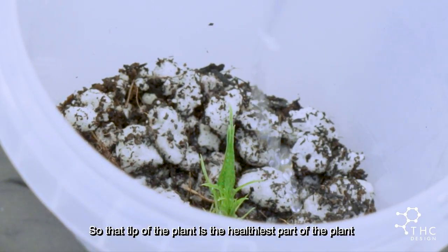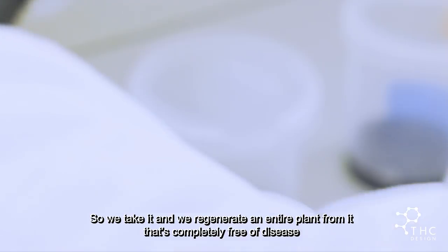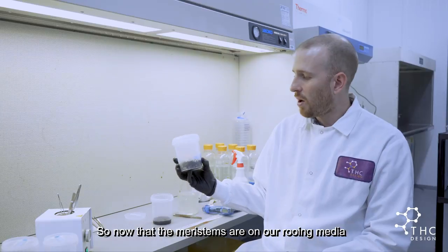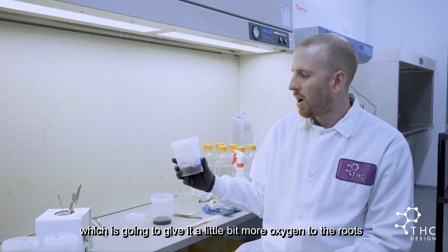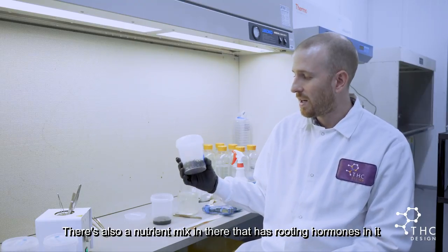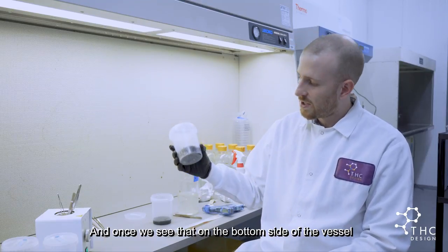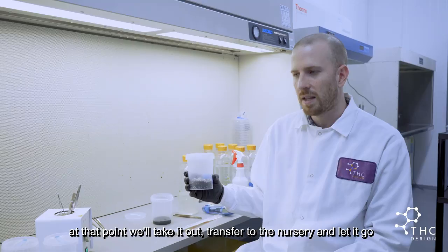The tip of the plant is the healthiest part, so we take it and regenerate an entire plant from it that's completely free of disease. Now that the meristems are on our rooting media — which provides a bit more oxygen to allow roots to get established — and there's a nutrient mix with rooting hormones in there, it will stand for a period of time until the roots are established. Once we see that on the bottom side of the vessel, we'll take it out, transfer it to the nursery, and let it go.